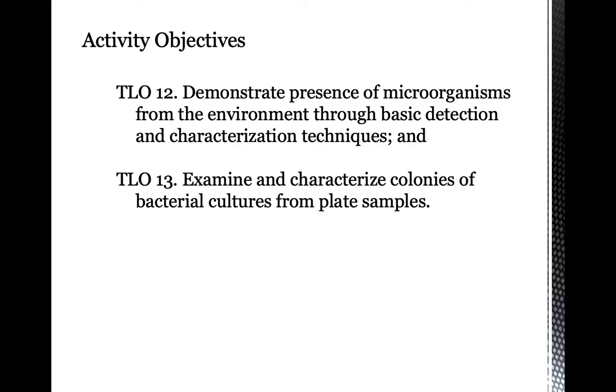I have provided videos, I think I only found 2 relevant videos, and a photo documentation so that you can visualize what's being done in the procedure in the module. Then lastly, also be able to examine and characterize colonies of bacterial cultures from the plate samples.